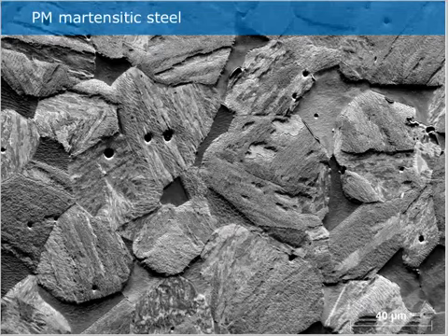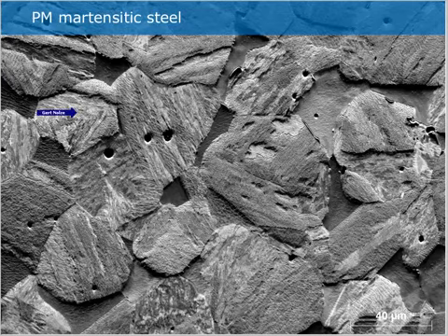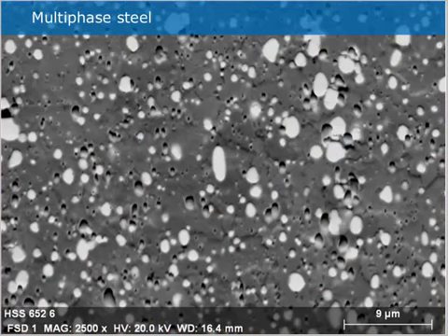The ferrite in martensitic steel, we have here residual ferrite, and these were once high temperature austenitic grains, and they have been transformed into martensite. On the sample surface topography, you already see, okay, there are definitely different so-called variants, which show grains of different orientation. And if you go to the color mode, you see much better how orientations can be visualized. There's no quantification possible, at least at the moment, but it shows very nicely different orientation. You can select a region which is probably interesting for an EBSD map.